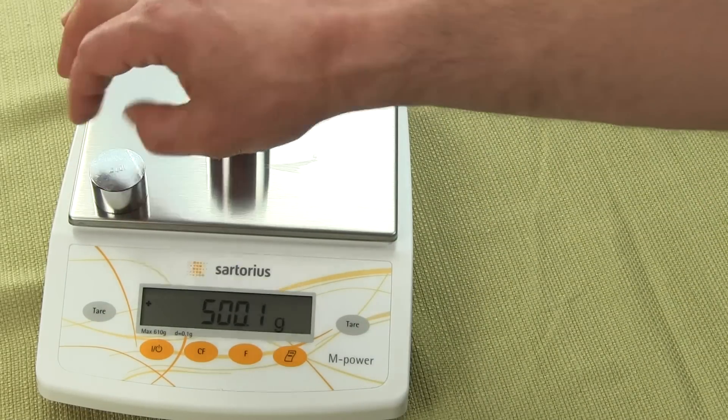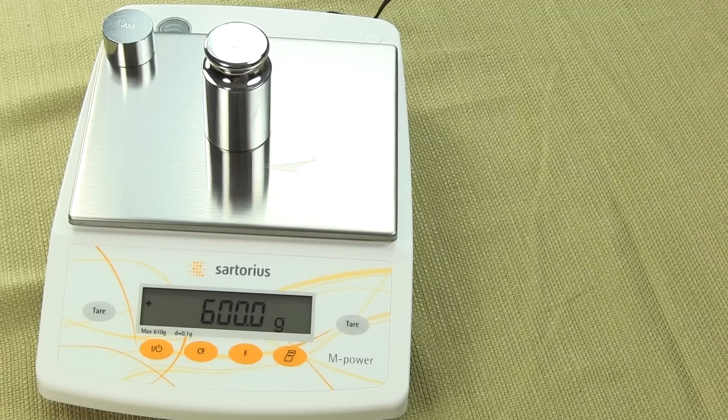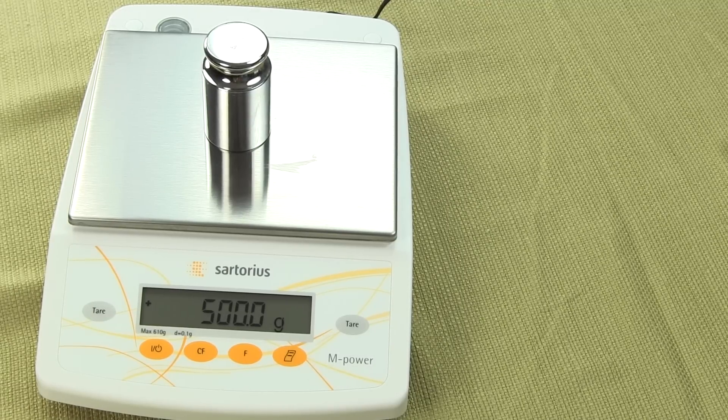And it's a large weighing platform. If you compare it to other comparable models in this sector, having a large 6.8 by 5.6 inch platform — that's large for this type of portable top loading scale. So that's how you calibrate the scale.